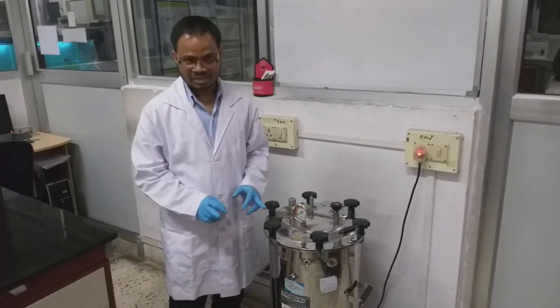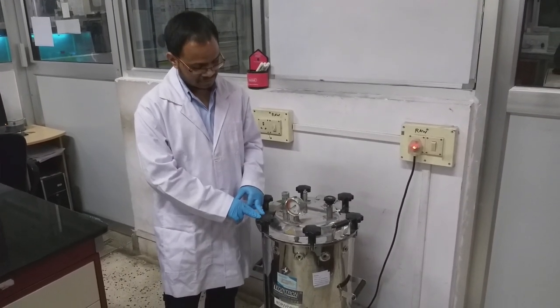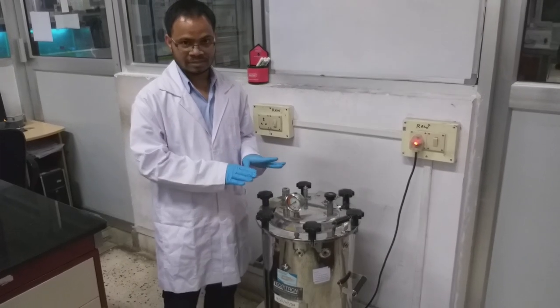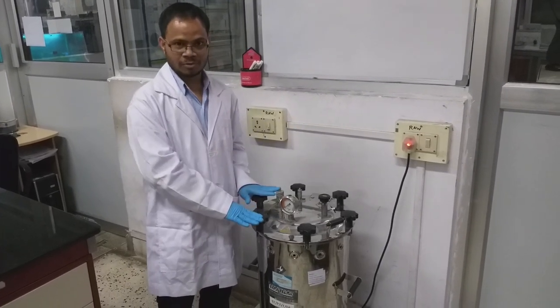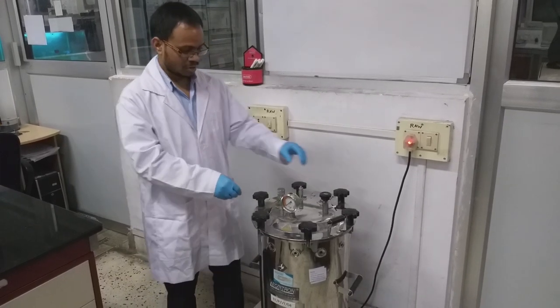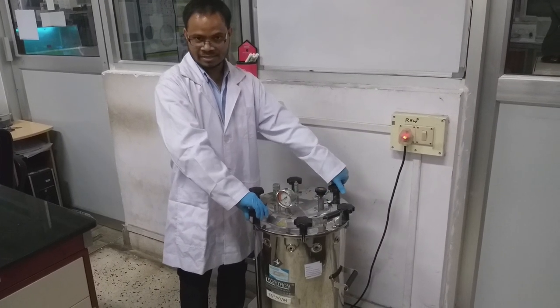Once the pressure and temperature reach 121 degrees Celsius and 15 psi pressure, you have to hold at that point for 20 minutes. Then you have to turn off the machine, let it cool down and remove the components. The same procedure applies while opening: you have to open in the opposite direction.